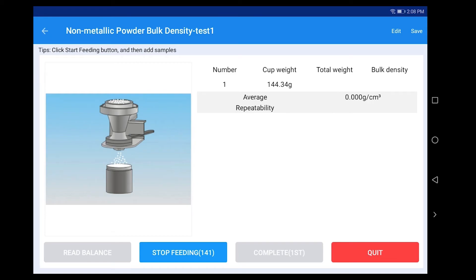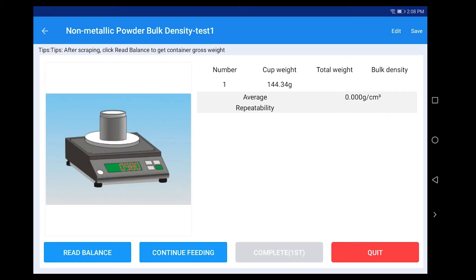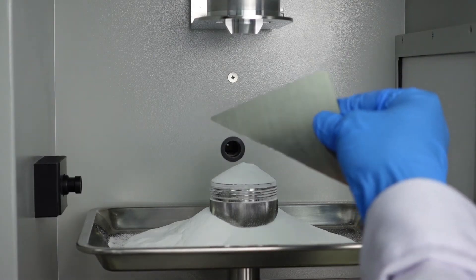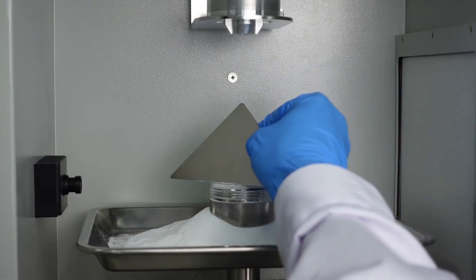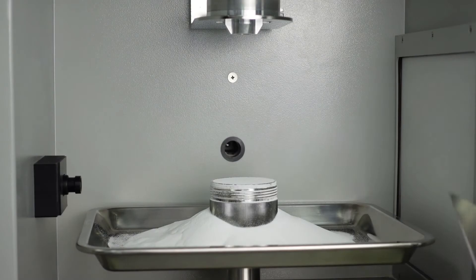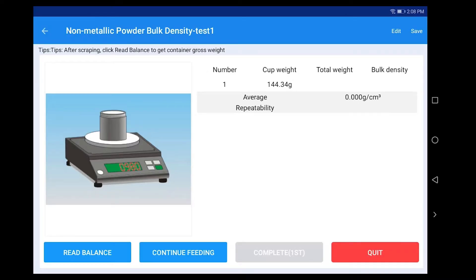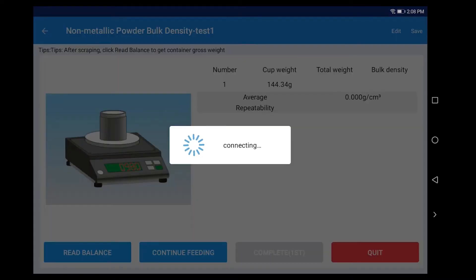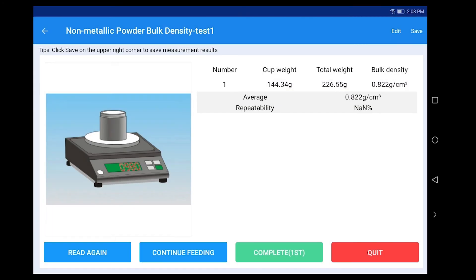Click Stop Feeding. Scrape excess powder from the top of the container with a scraper. Take out the container and place it on the balance. Click Read Balance to read the total weight and calculate the bulk density.